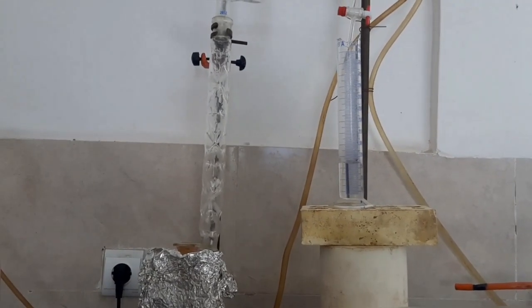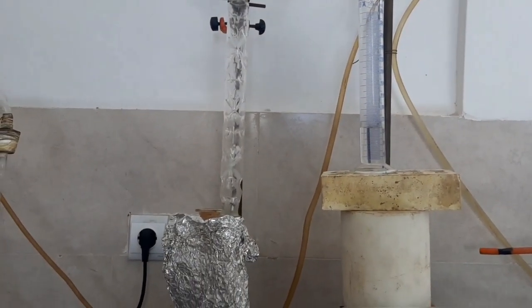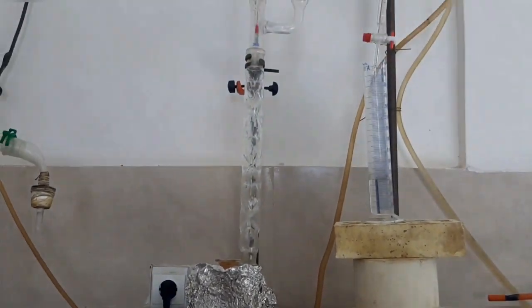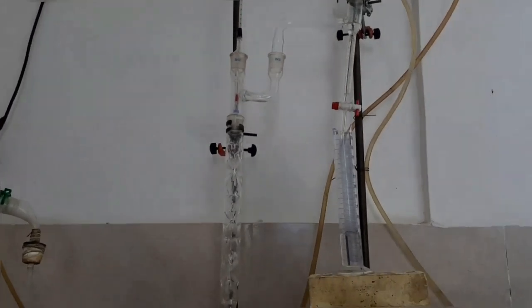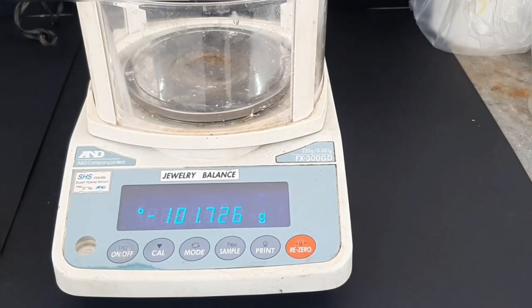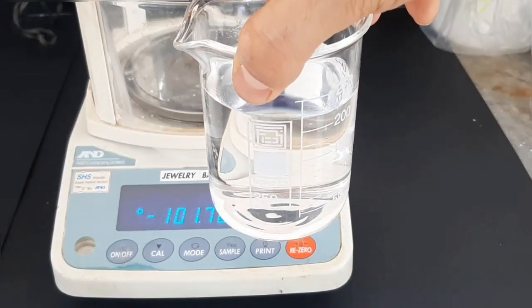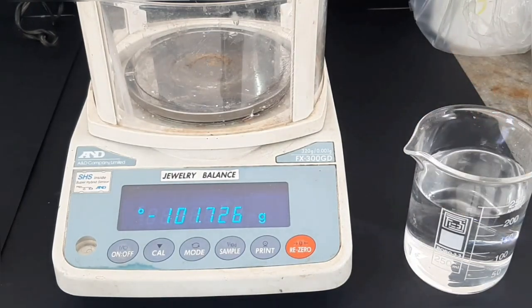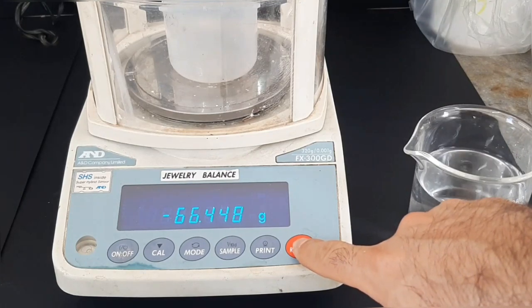So we have collected some more product. It took an hour to get around 70 milliliters of product. But we don't want the temperature of the overhead product to reach 70 or even 69. And the reason is that the 70 degrees mark is actually the binary azeotrope of ethanol and ethyl acetate at 70% ethyl acetate and 30% ethanol.